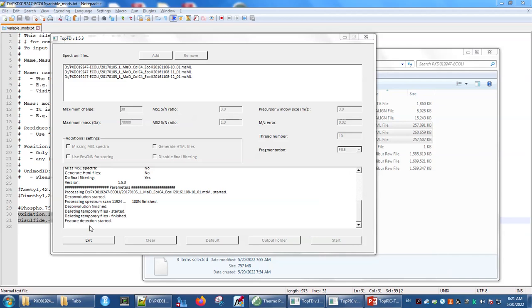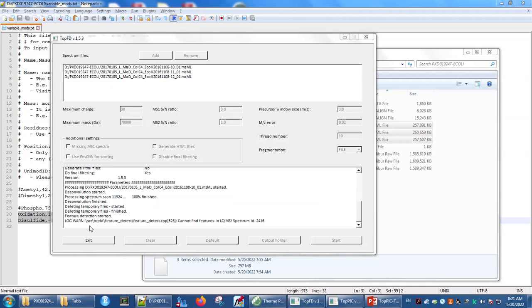So naturally, the tandem mass spectrum doesn't contain the only information pertinent to identifying each tandem mass spectrum. We also need to know what was the precursor charge state, and from that, what was the precursor mass. That means we need to be able to detect to as great a mass accuracy as possible what the mass to charge value of the precursor is. We have multiple isotopes of it, and we may even have multiple charges of the precursor in the mass spectrum.